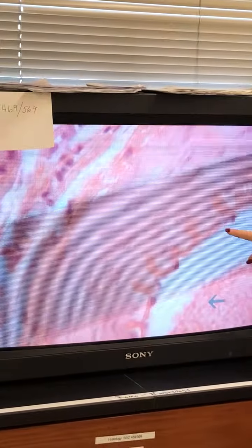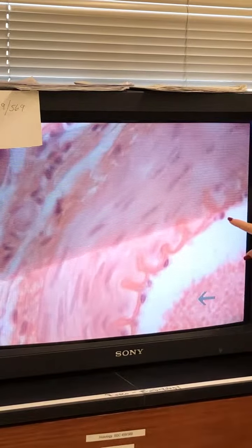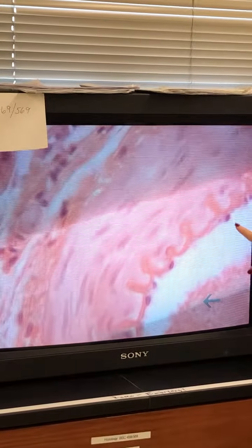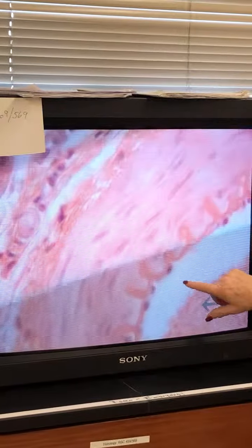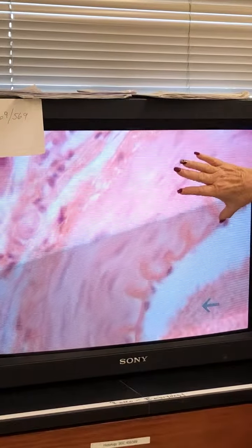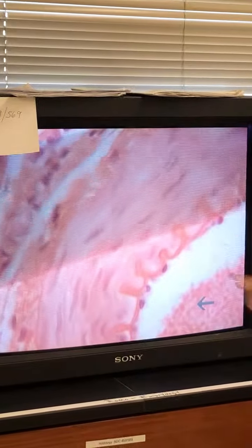And then if we could see up, we could say what specific layer this was, if you saw these bump outs. The bump outs would be the endothelial layer, and then if I was down here, that would be the subendothelial. Yeah, exactly. Okay, so your turn.